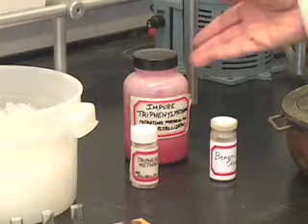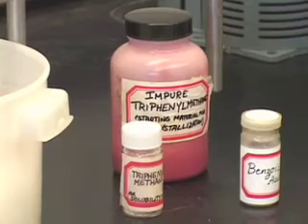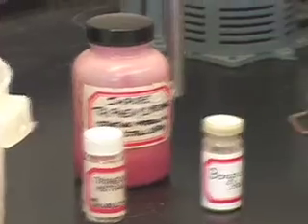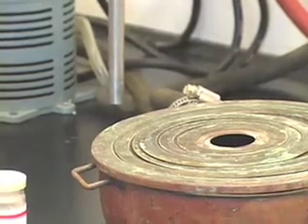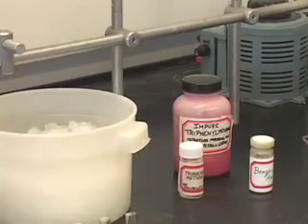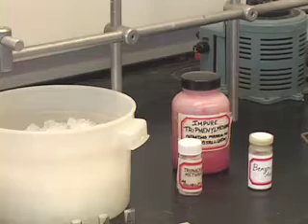The solid, in this case the triphenylmethane, will have to be insoluble in the solvent at room temperature, but should dissolve in the solvent when heated in the steam bath, and then when you cool this solution in which your solid has dissolved at higher temperature in an ice bath, the solid should reappear. So, the solvent which satisfies all these criteria would be the one to use for recrystallization.